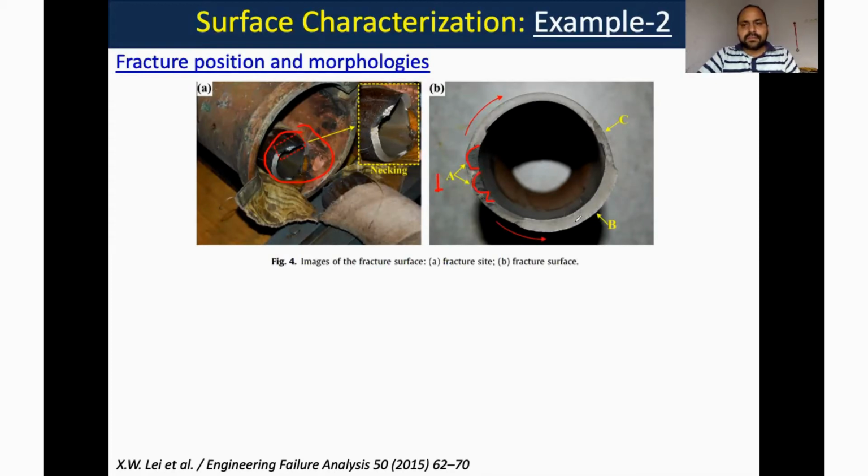And then there is a B region, the second region. Here it forms, and it looks like it is going to extend this way from A to C, right? And then the C region. Here something is initiated, goes this way, and then something is fractured in this region. So C is a kind of fracture zone.